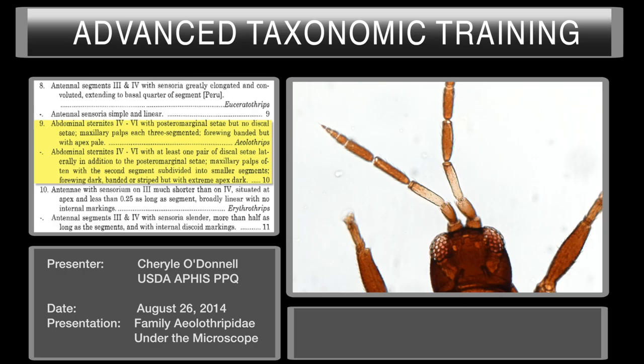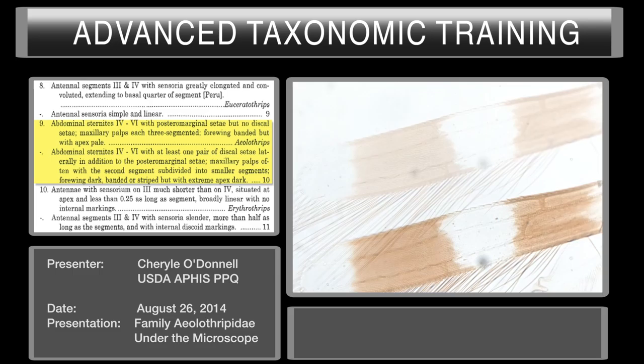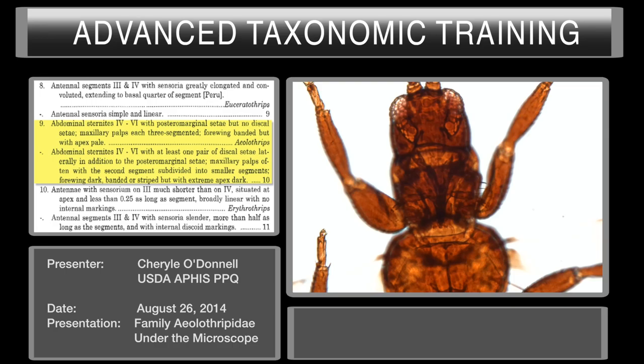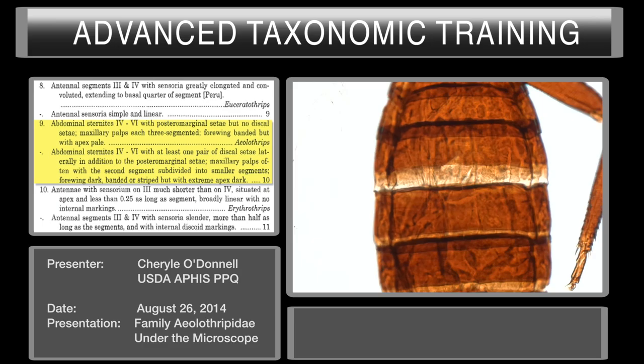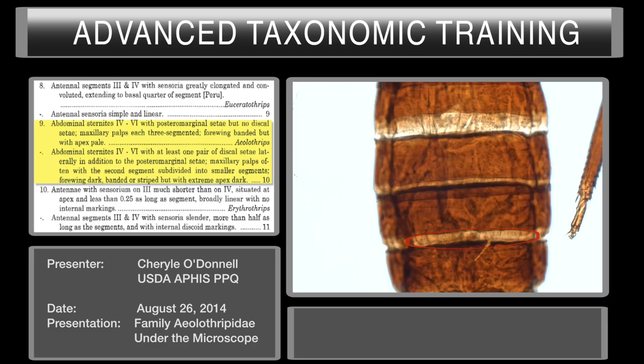That takes us to couplet number nine. Our choices here are: abdominal sternites four through six with post-marginal setae but no discal setae, and maxillary palps each three-segmented, with forewings banded but with apex pale. We do have banded wings — that's one of the choices in our couplet. The maxillary palps are three-segmented; you can barely see them but they are here: one, two, and three.